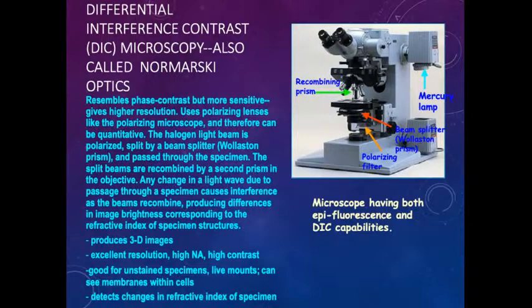Either go for epifluorescence, phase contrast, a polarizing microscope, simply bright field or dark field, or the advanced electron microscopes: scanning electron microscope and transmission electron microscope.